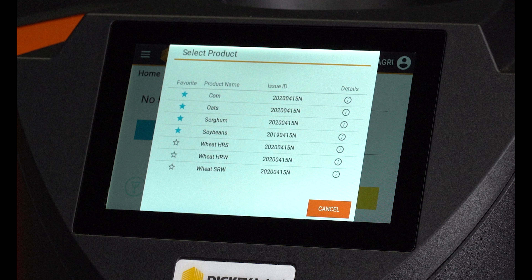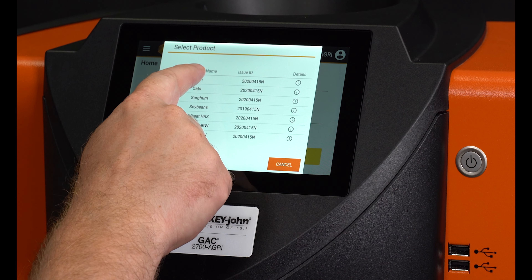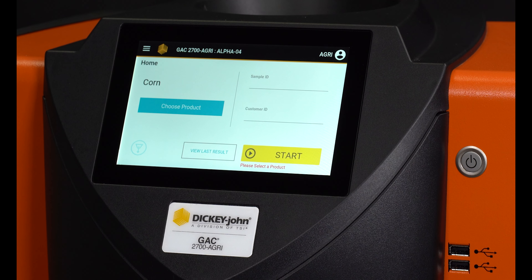A pop-up window will appear showing all grain calibrations installed on the instrument. Press the desired grain name and the product calibration will automatically transfer to the home screen for analysis.